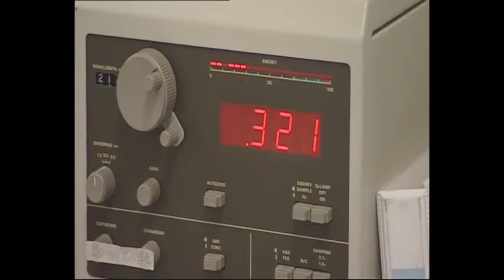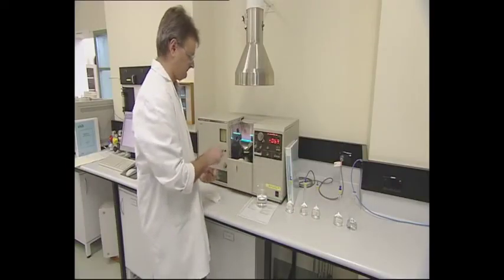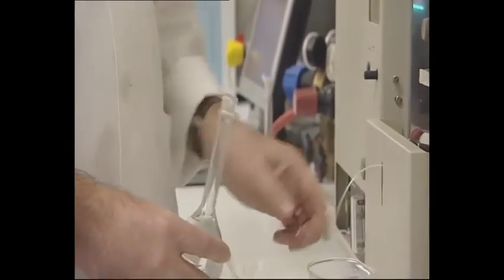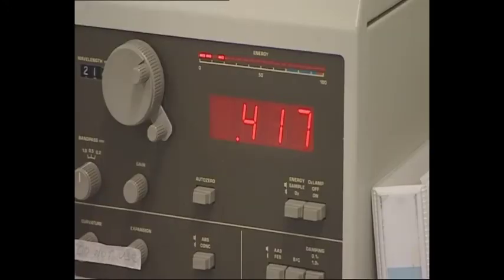Reading this time of 0.32 and our highest concentration standard at 20 milligrams per litre. Giving us a reading of 0.42.